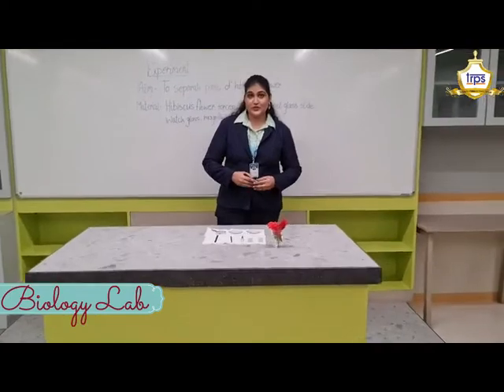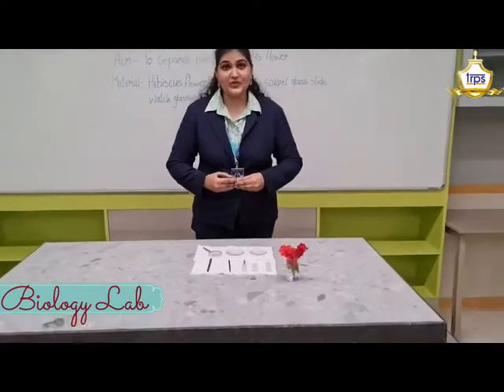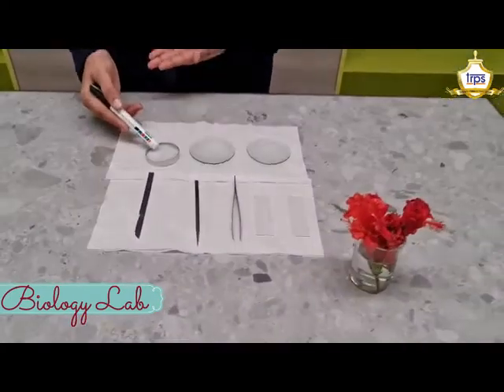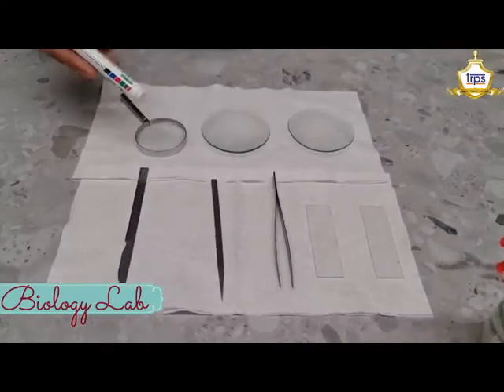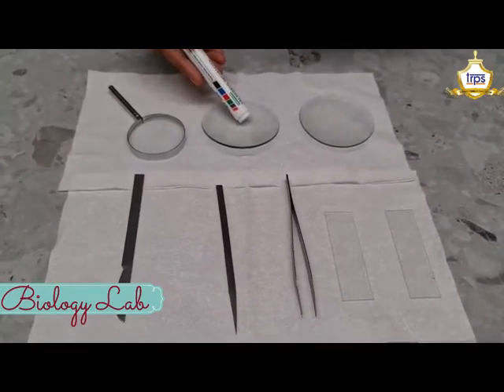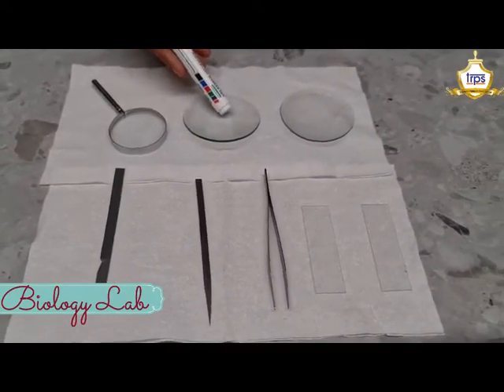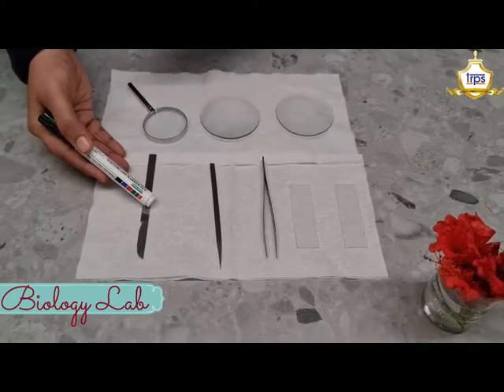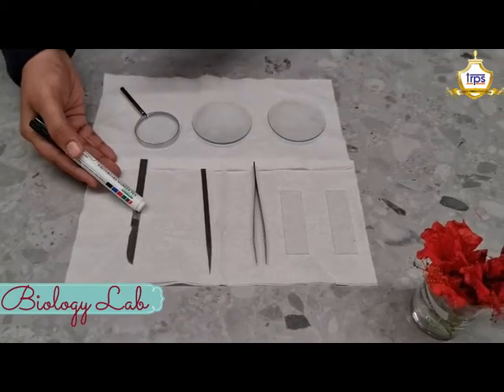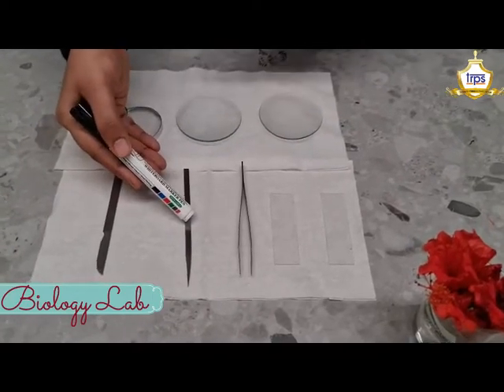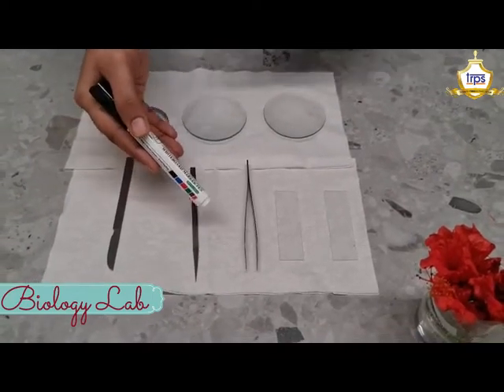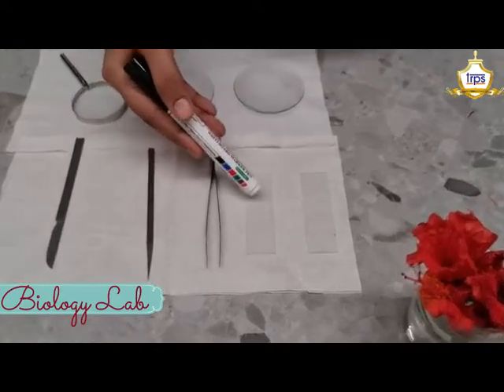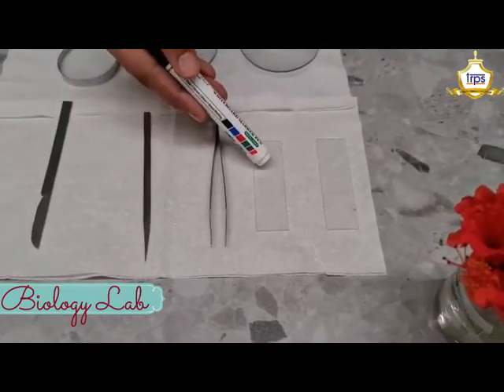Let me introduce you to the tools. This is a magnifying glass. This is the watch glass. Here we have the scalpel. This is a needle. This is the forceps. This is the glass slide.